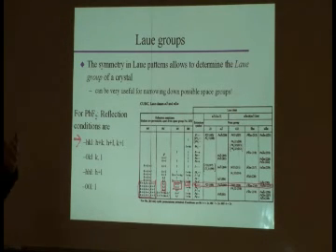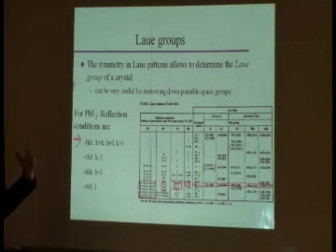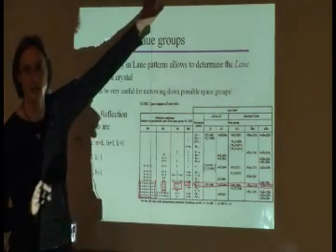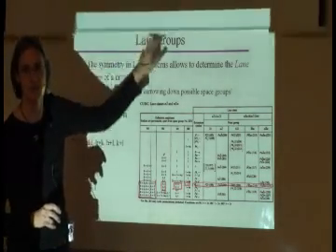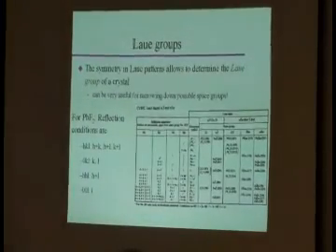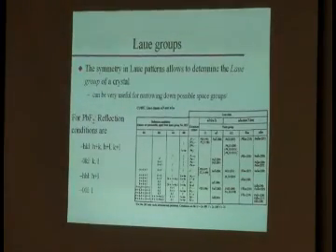And of course, in some cases, people want to measure properties of crystals along certain symmetry directions, and that is where the Laue photography comes in. You need to know what your face index is in order to determine what the properties of this crystal are, right? So most of the time, people work with some pretty big crystals, and they're fairly easy to orient. Does that make sense? Neat little application, isn't it? And all of a sudden, some of these things actually fall together. That's why we had to go through some of them.